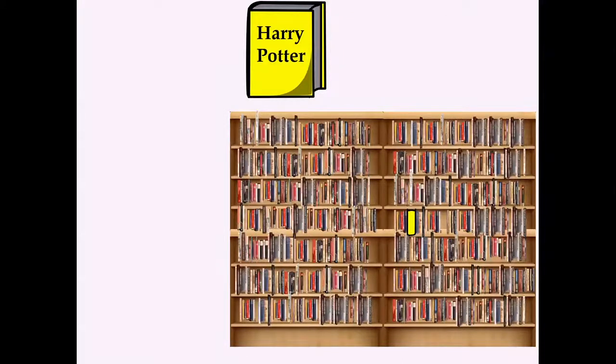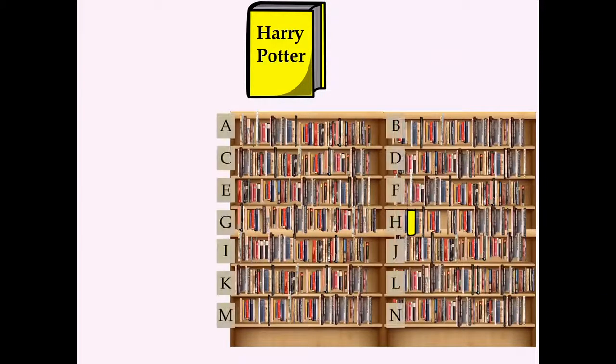So another way to think about this is kind of a targeted analysis, and that is that we know a lot about this book. We know, let's say it was sorted in the library alphabetically, so then you could go and say, look, I'm going to go and look for this book under H.